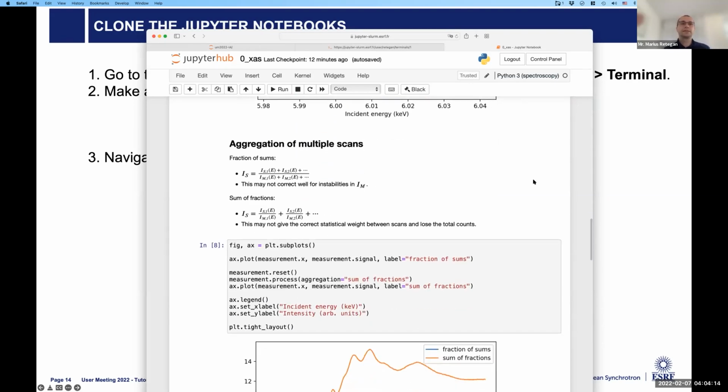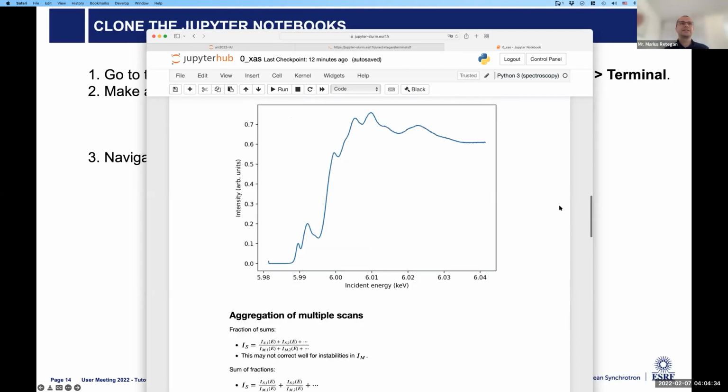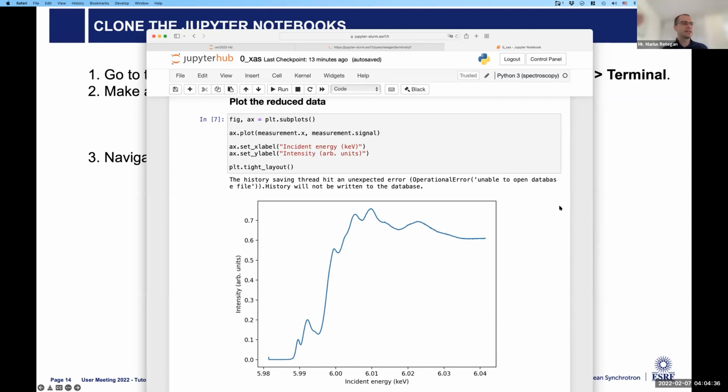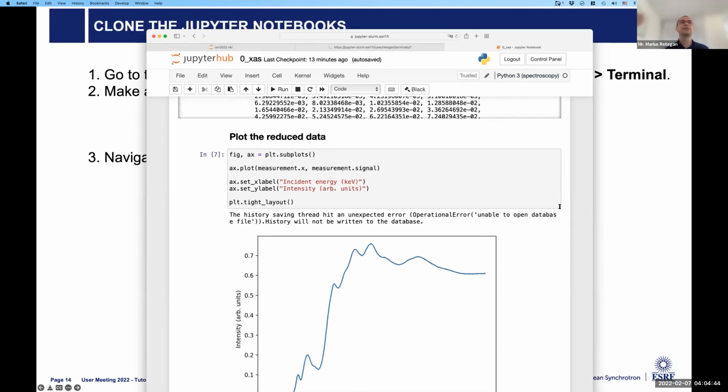Yes. So Marius, we are able to import local data from our computers, I assume. Yes, it's possible. It's a little bit under testing because it varies a lot. If it's only two columns, and maybe a third column with a signal, it shouldn't be very difficult.